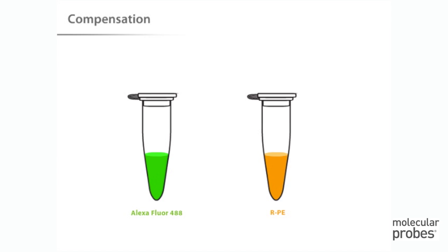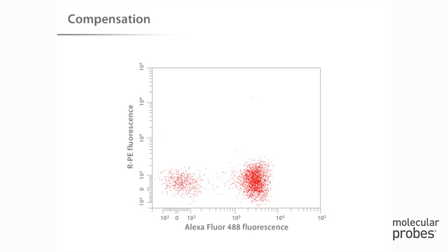In order to see the amount of compensation required to correct the fluorescence, we need single color samples — either aliquots of the cell sample stained with each fluorophore separately, or microspheres that capture an individual reagent. Starting with the Alexa Fluor 488 stain, what you want to see is a population with bright fluorescence in the Alexa Fluor 488 channel. However, these same cells also emit fluorescence into the RPE channel, which results in an apparent upward shift of this population.